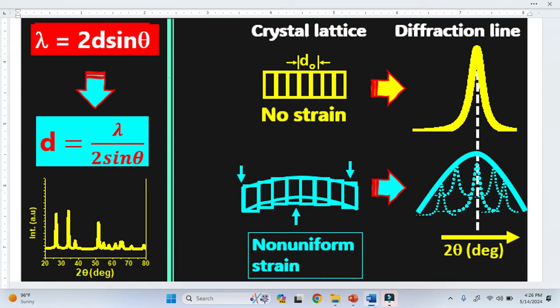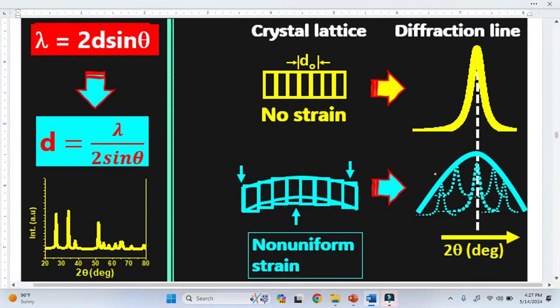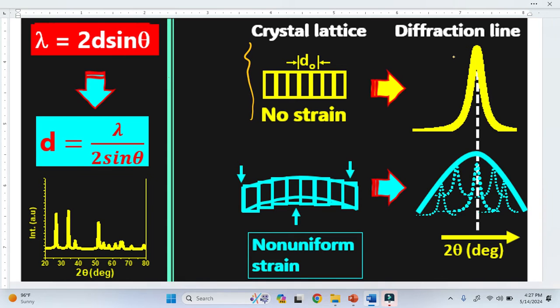In XRD analysis, sometimes the peak shifts toward the left or toward the right, and sometimes we get a broad peak. In today's video, I'm going to explain why we get a broader peak in XRD analysis. This is basically the crystal lattice, and these are the diffraction lines or XRD peaks.